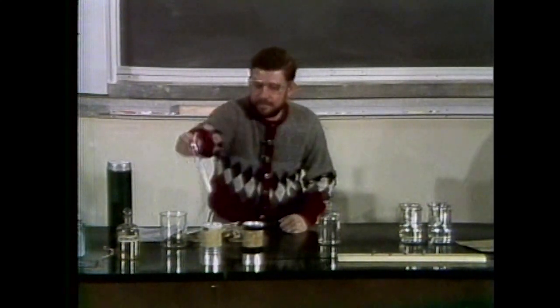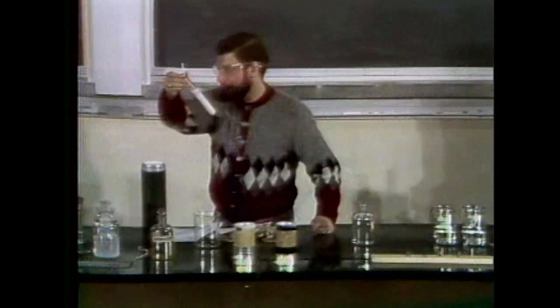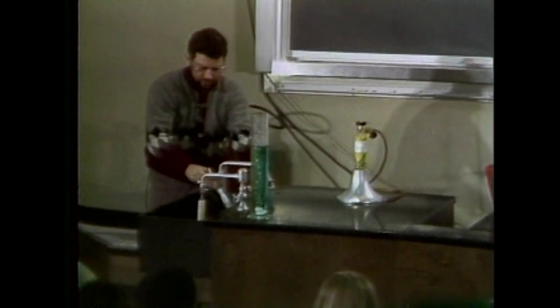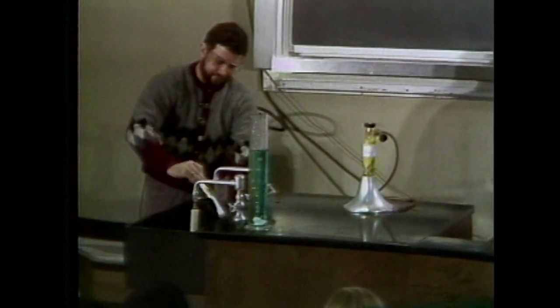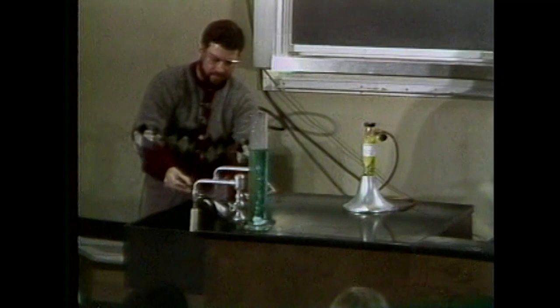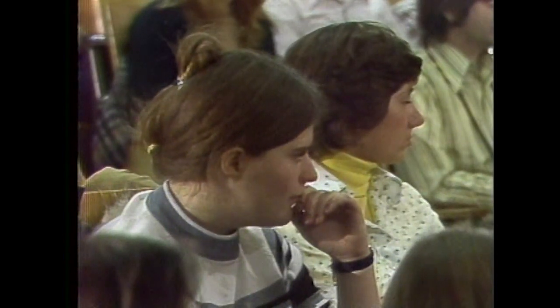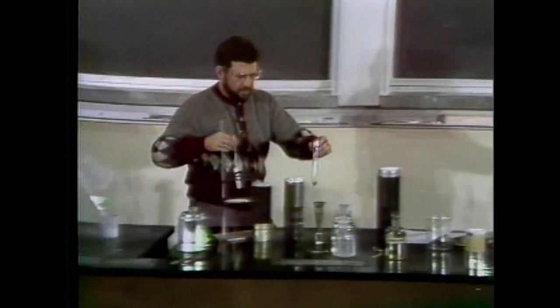Okay, let's see what's happening over here with this kerosene that we've put in here. Let's go over and warm up the outside a little bit by just putting some water on it. And you see what we have is a kerosene candle.